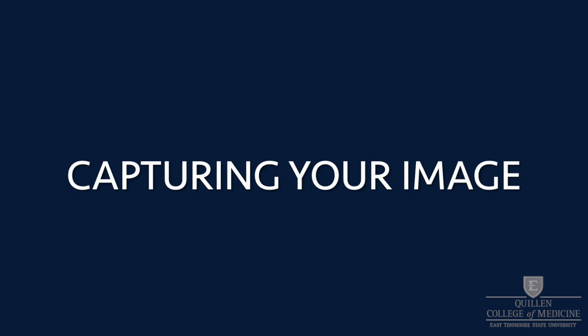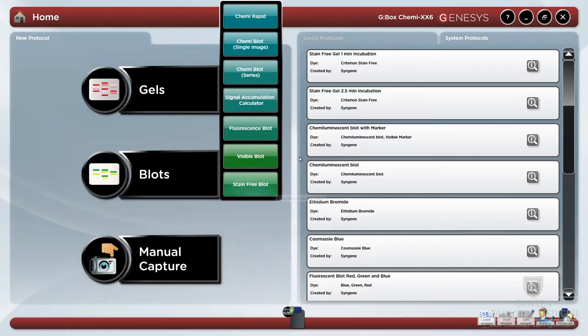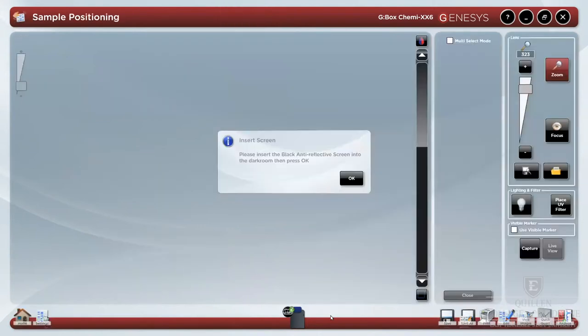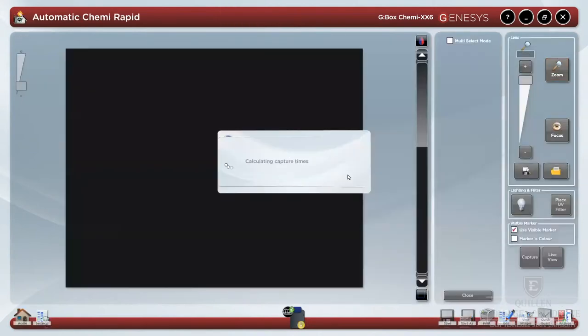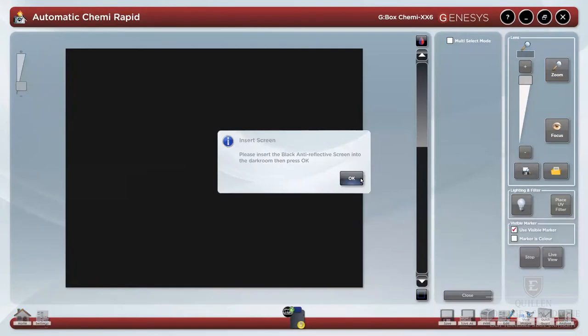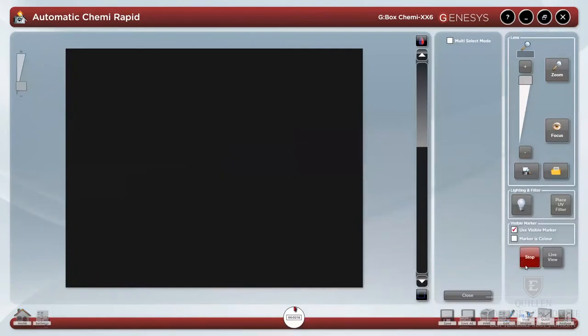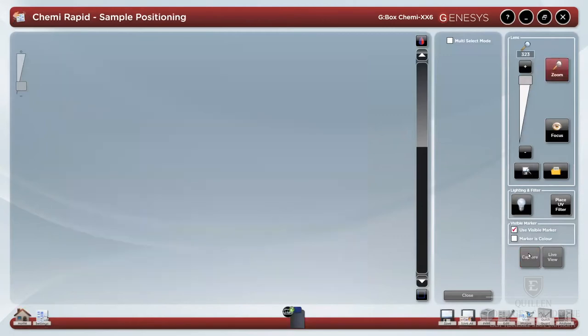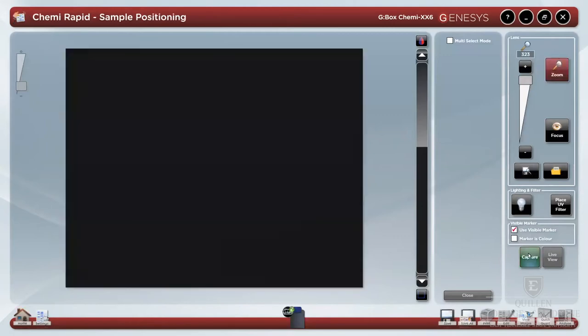To capture your data image, select either gel or blot from the menu. KimiRapid is the most commonly used menu item. The digital darkroom will immediately begin an exposure and ask for any needed anti-reflective screens. To stop this process and unlock the digital darkroom, select stop.